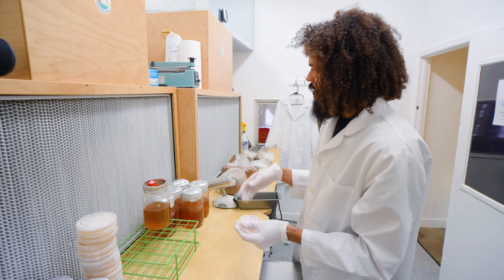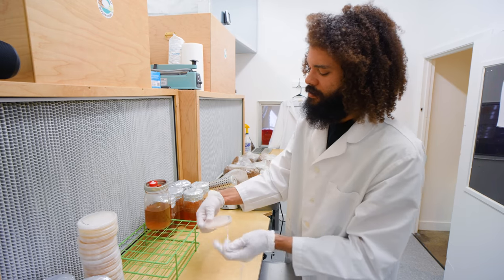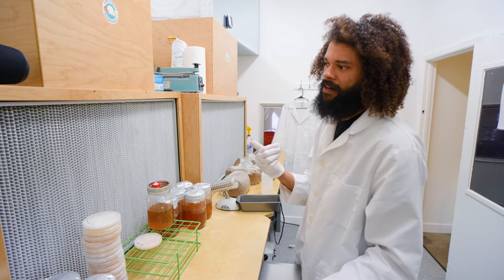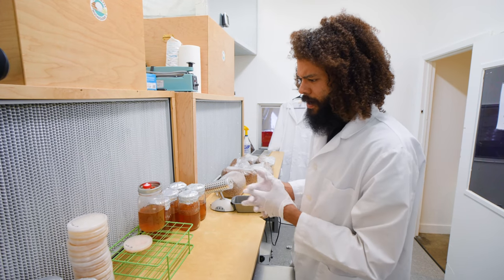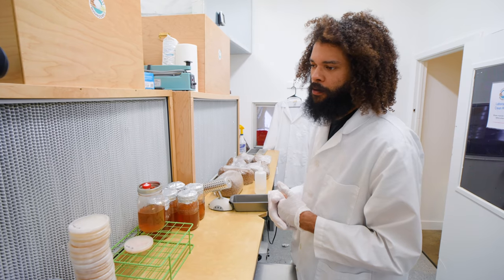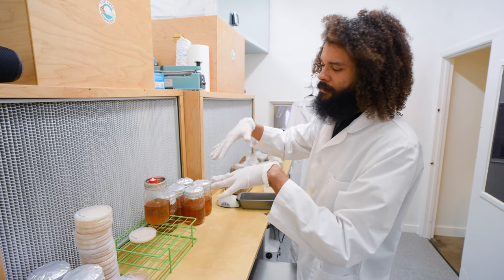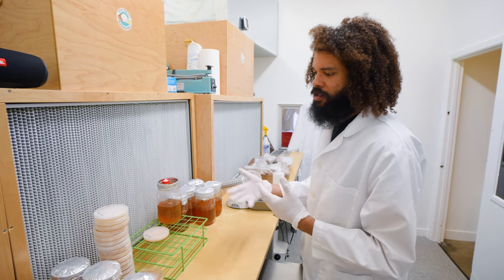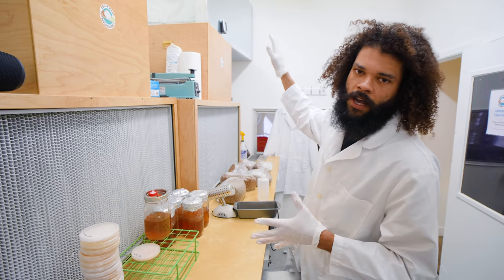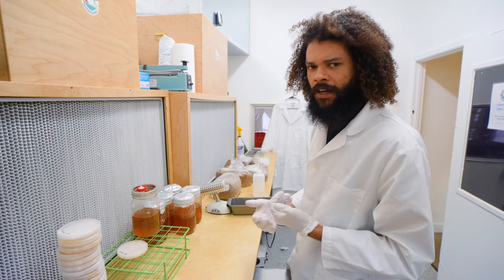The lab at this point is basically 10 feet of HEPA filtration. There are a few HEPA filters built into these cabinets with a blower housing atop each cabinet that pulls air in and pushes it through the HEPA filter. This ensures the air coming out is sterile and free of airborne particulates or contaminants, pushing any dust away from your work area. We also have air coming in from outside the lab to create positive pressure, keeping contaminants from entering the room.